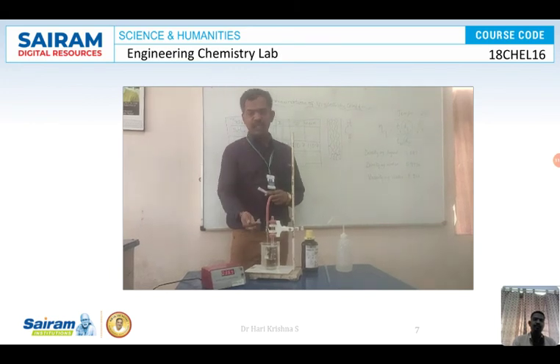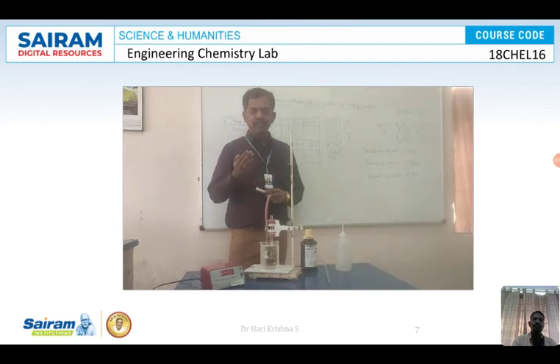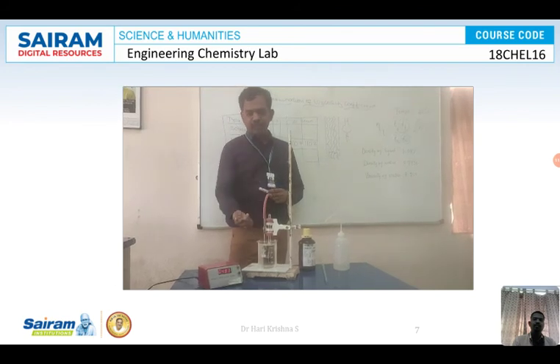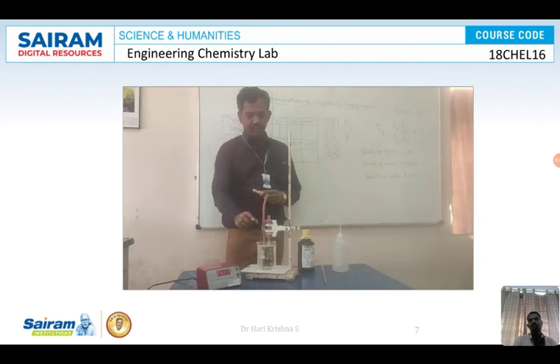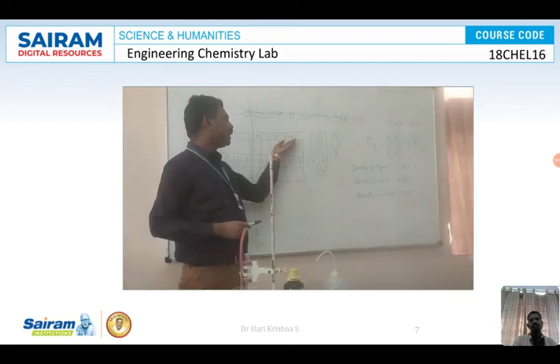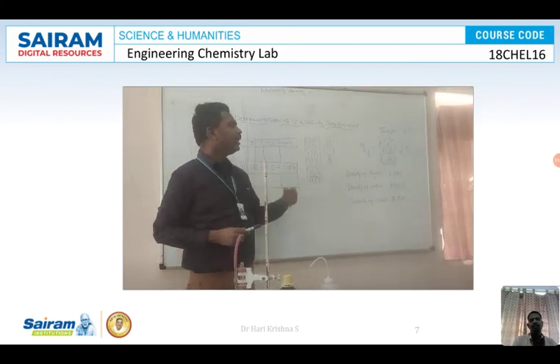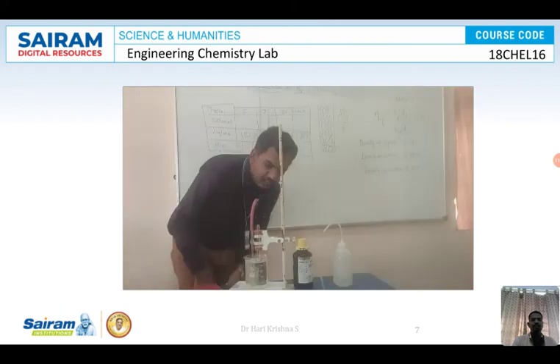We are also going to take a dry viscometer. If you have any organic solvent, what will happen? Two layers will be formed and the viscosity will vary. So always care should be taken that the viscometer and solvent are dry. The dry viscometer is taken and we measure the flow time of the water from this point to this point. Once this is done, we calculate the mean time taken for the liquid, the mean time taken for the water, and calculate the viscosity coefficient of the given organic liquid at the given temperature.